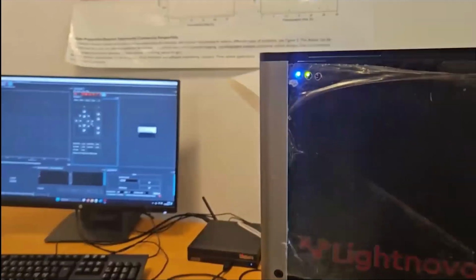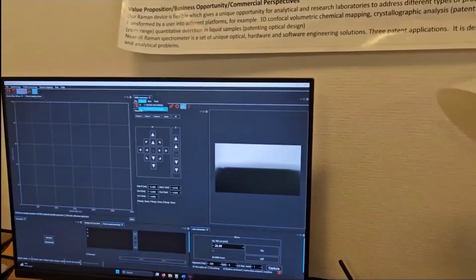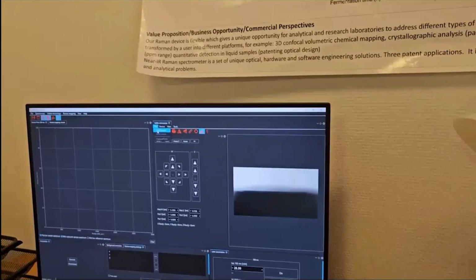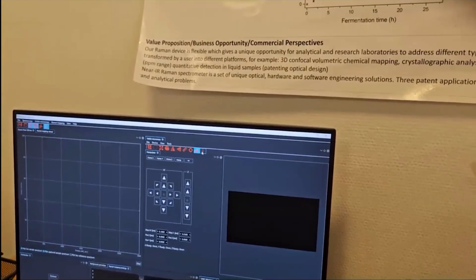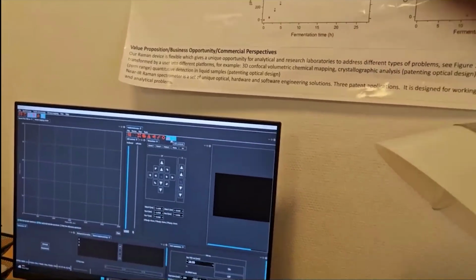And we actually have two cameras with the sample. One camera is looking from the side; you can see it over there in the end. Then there is this camera, and another camera is looking through the microscope objective. Please switch the camera. Choose the proper device and file, start the camera. Now we have the proper camera, and it's far away from the device, and now we have to switch LED controllers as well. LED control, LED is on full power, LED is on top over here, and then we'll focus on the sample.